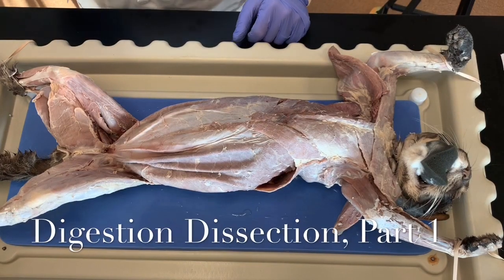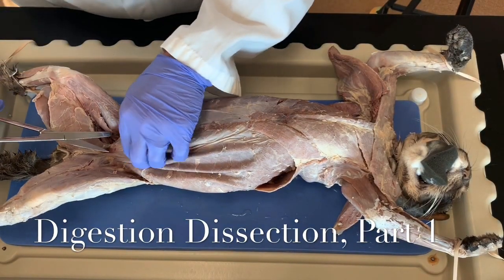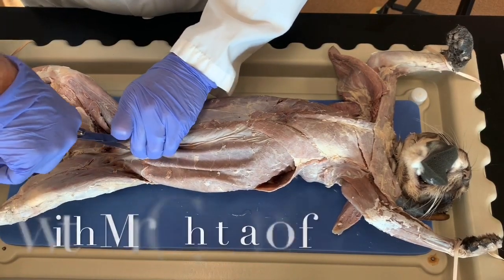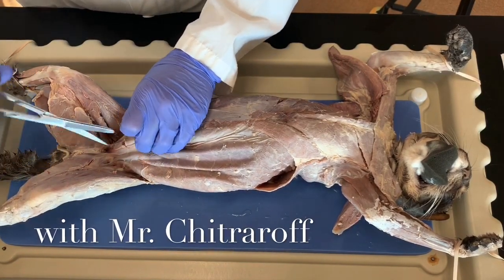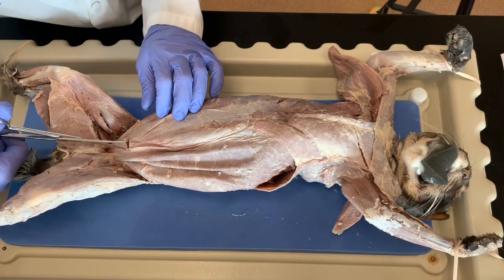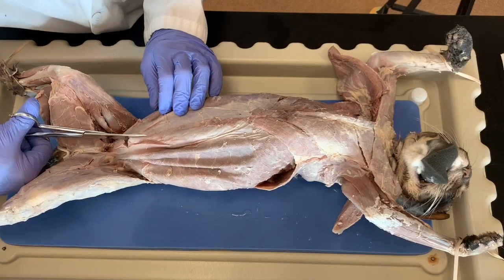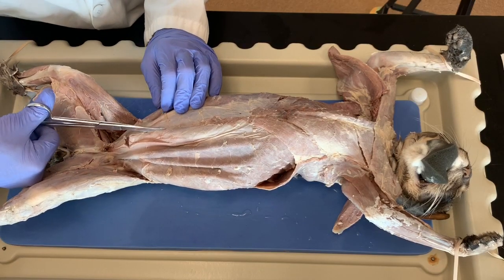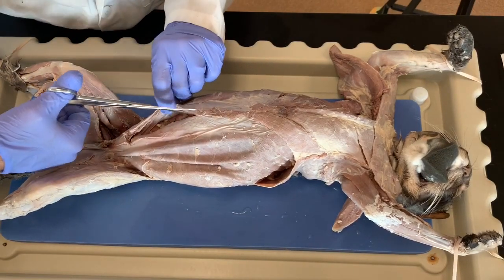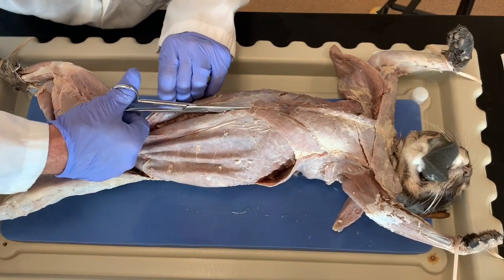All right, we're gonna start the incision on posterior end. Again, we're gonna pull this up and make a little cross incision. And then we're gonna hook through the blunt side, and we're gonna do a mid-sagittal all the way up the abdominal cavity, lifting up as we go so we don't damage any of the tissue underneath. So there we go, up to the chest.